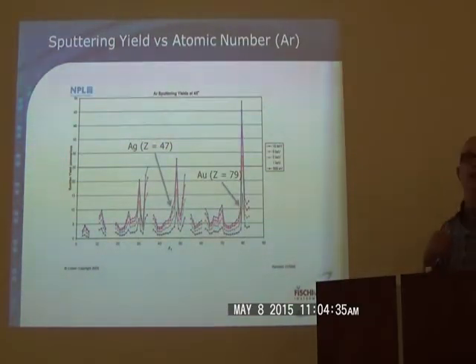How does the sputtering yield truly vary for different materials? It's not exactly easy to understand. If you know the periodic table that you may have seen in chemistry, in general, as I increase the atomic number from, say, carbon at 12 to silver or gold or tungsten at, I believe, 74, in general, the sputtering yield goes up. So there's more ions ejected for each incident one, more pins knocked down for each bowling ball.